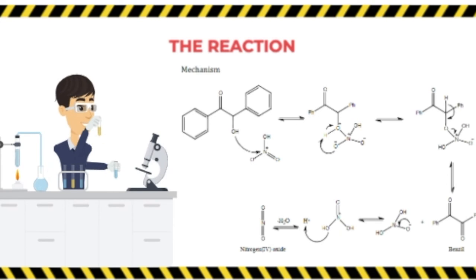And we can go ahead and run this compound that you see above through a mass spectrum, through an IR, and through a hydrogen NMR, and we can compare it to the actual mass spectrum, the IR spectrum, and the HNMR, which I have previously shown you for the actual compound of Benzil. And we can see if our results indicate that we do have a compound that is suitable enough to be Benzil, if all the data ranges match.